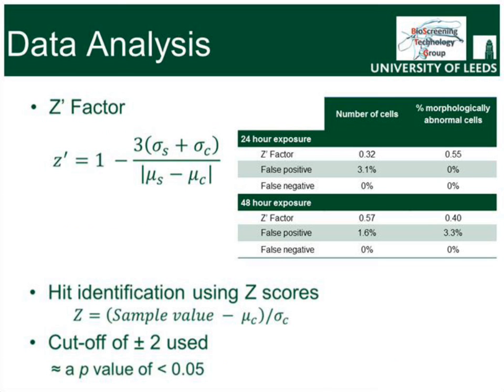Now that we have some degree of confidence in the robustness and specificity of the assay, the test library was screened in duplicate for each condition, with intraplate replicates generating 4 data points for each compound under the different conditions of 24 or 48 hours exposure.